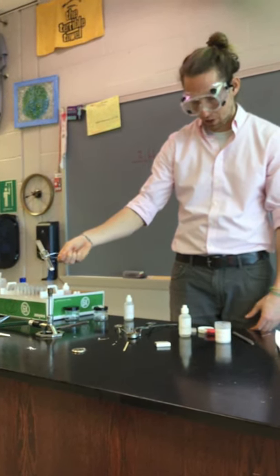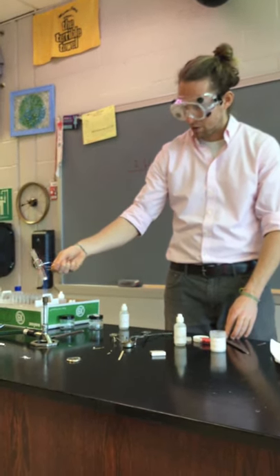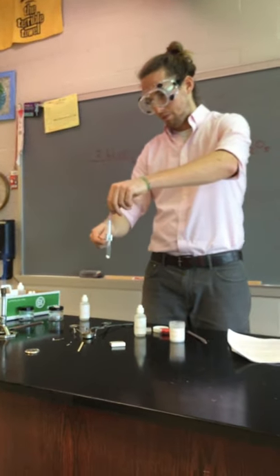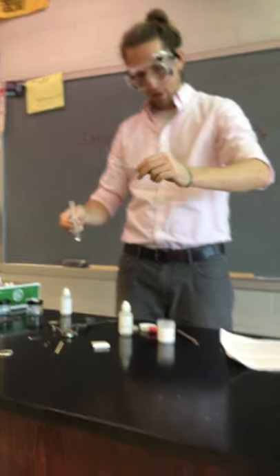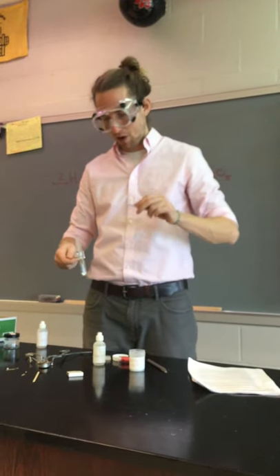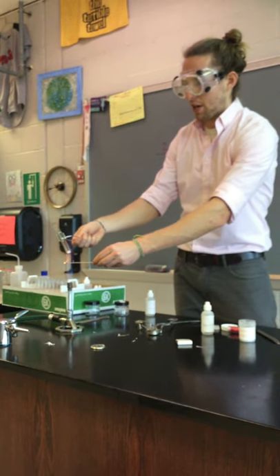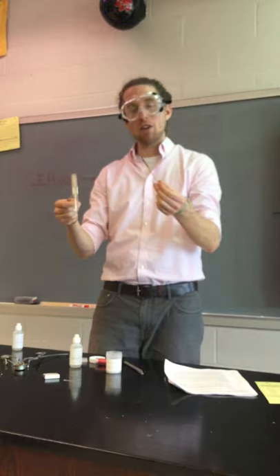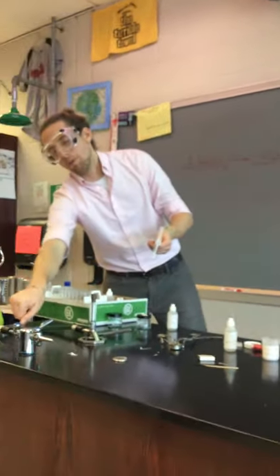So we're trying to decompose this ammonium carbonate. And let's see if we get anything when we put the litmus paper on top. And I don't know if you can see that, but it turned very blue very quickly. So it's no longer pink. It's now a very nice blue. I can actually smell the smell of ammonia if I walk it towards myself. And we again are going to light a wooden splint here, and we are going to see what happens when we put that in the mouth of the test tube.